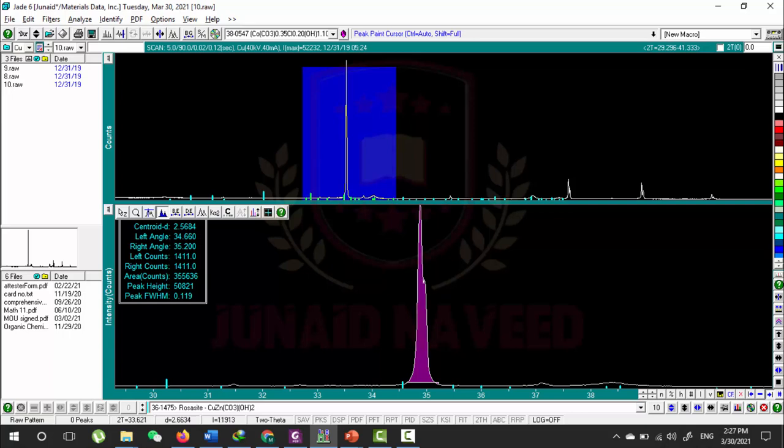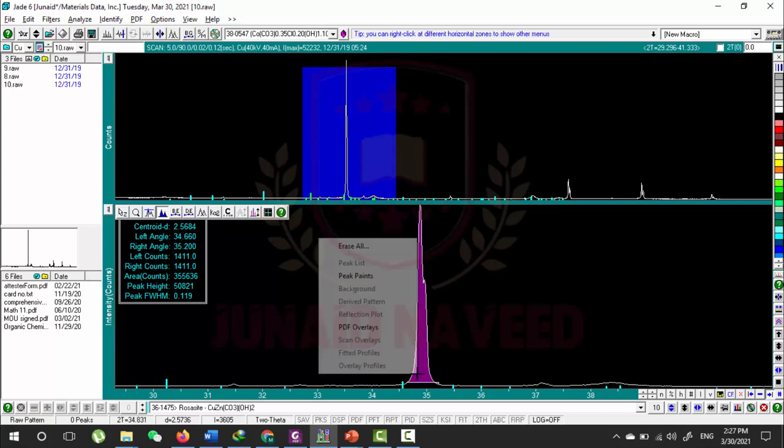From this painted area, it gives us some information like centroid, d, left angle, right angle, mean, left counts, right counts, area, peak height, and the FWHM width of this peak. You can get many informations from this.